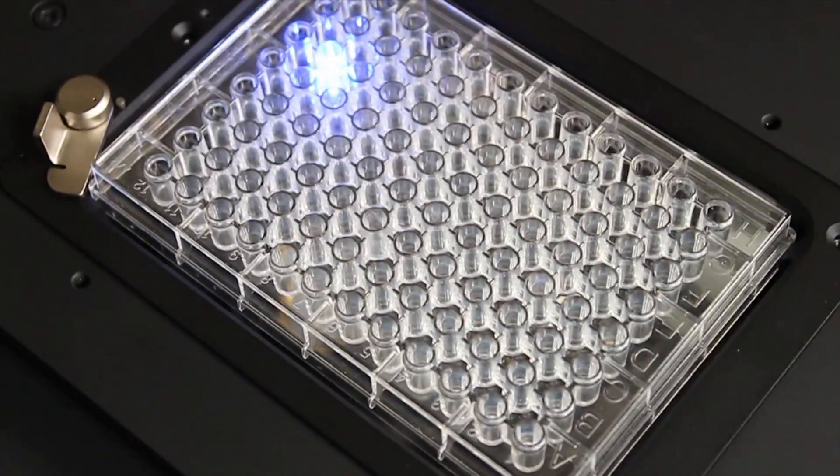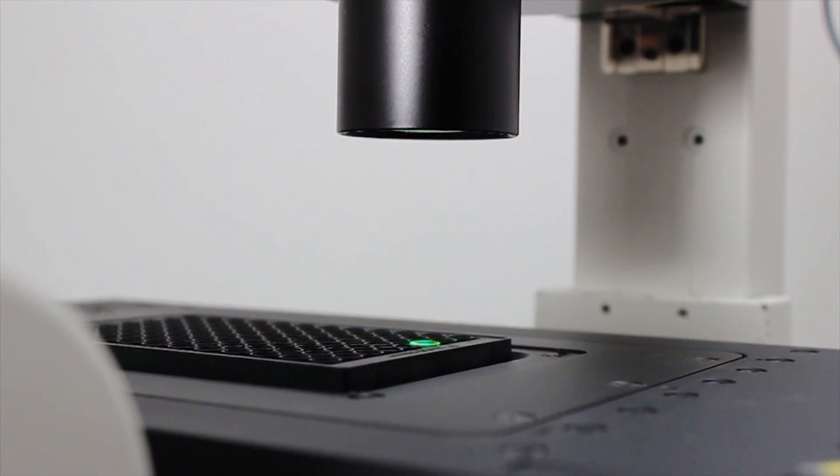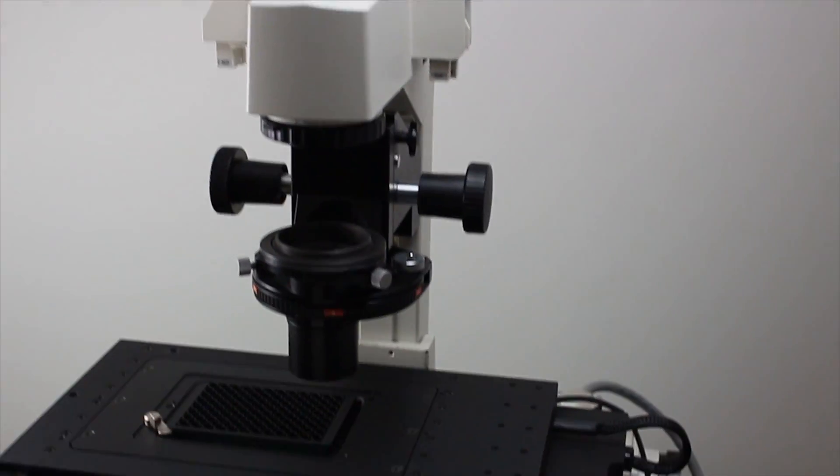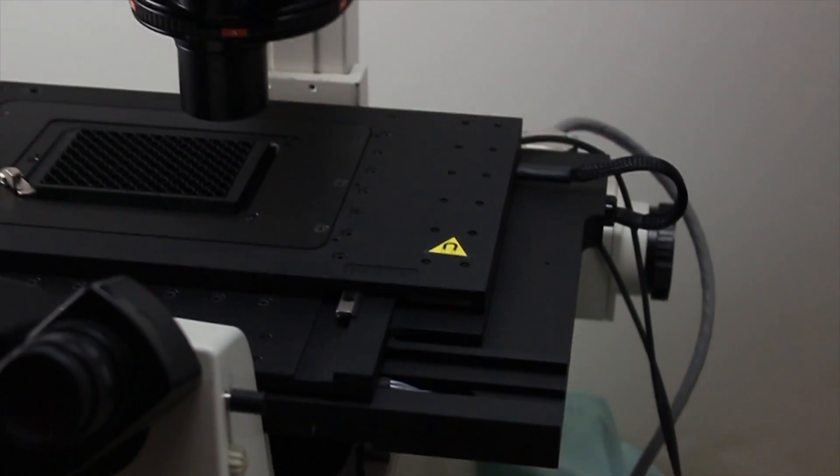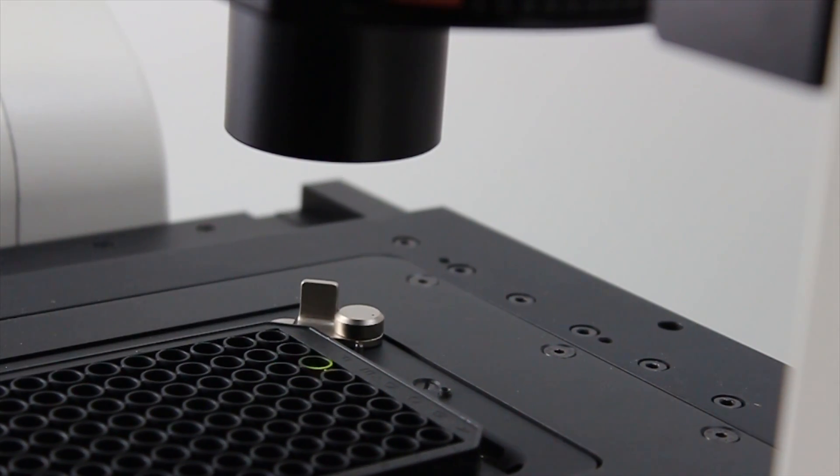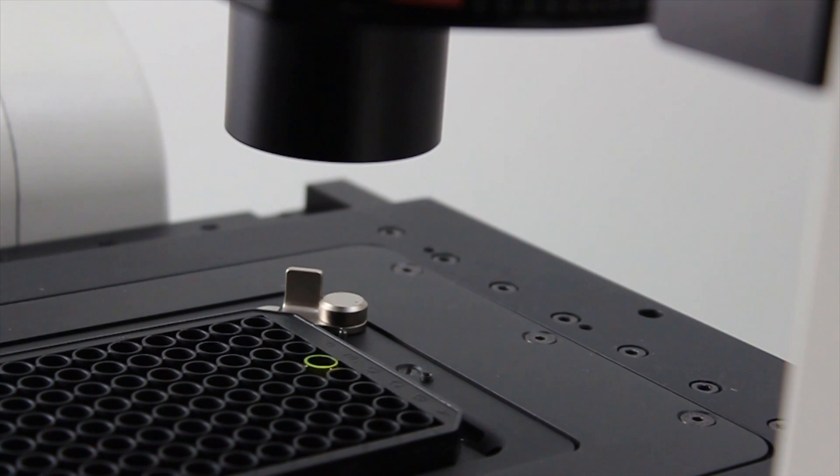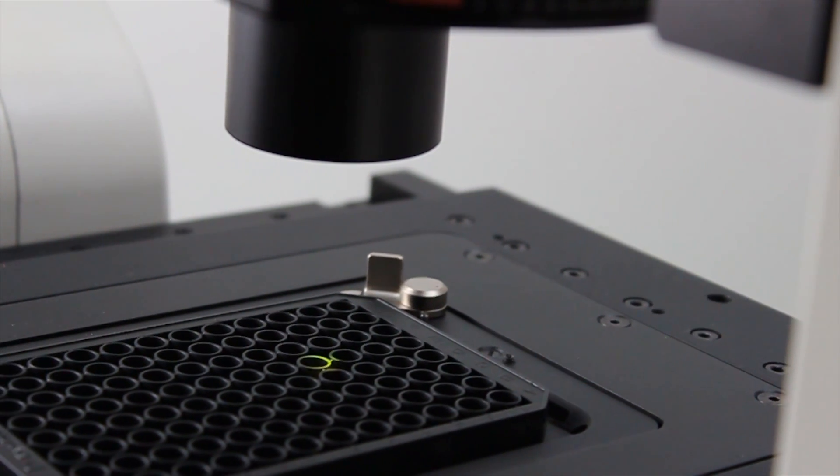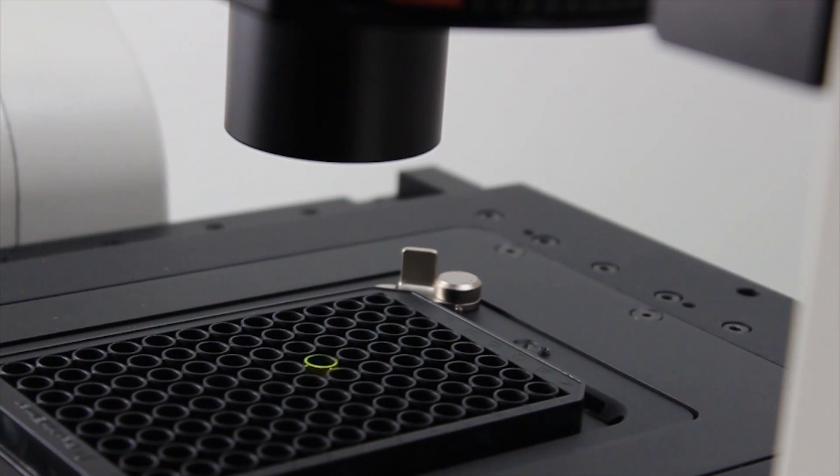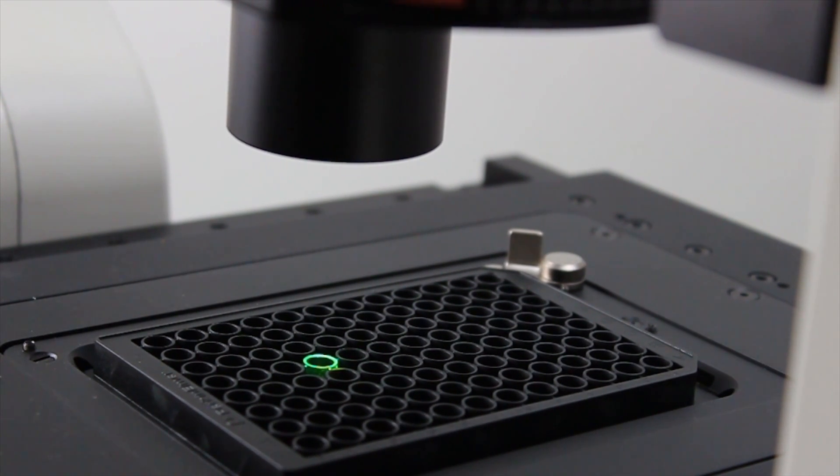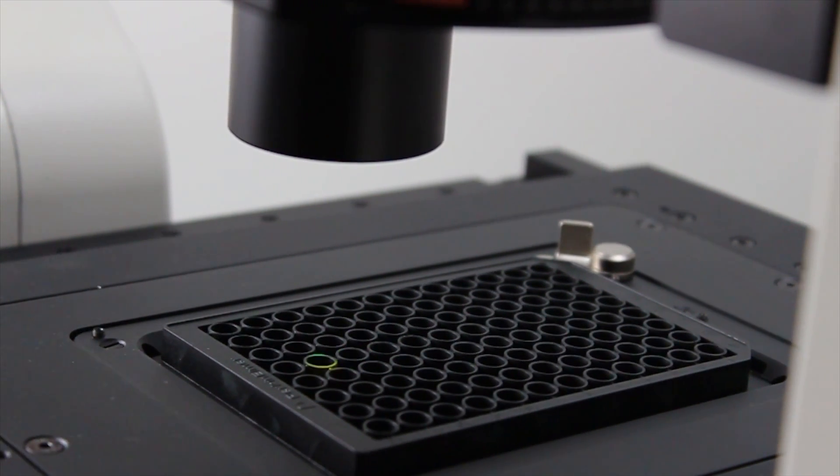Speeds of up to 300 mm per second, repeatability of 150 nm, a control system capable of unparalleled flexibility with TTL triggering, velocity controls for on-the-fly imaging.